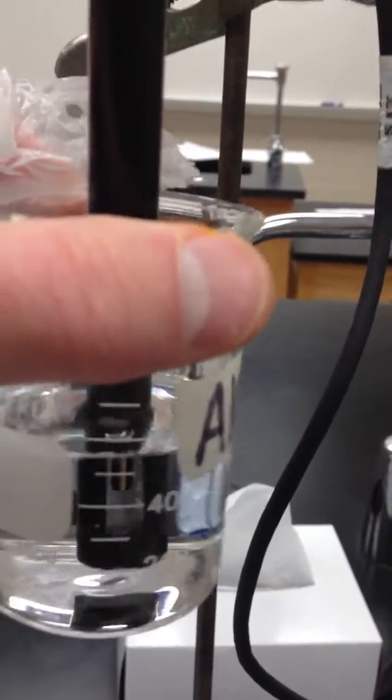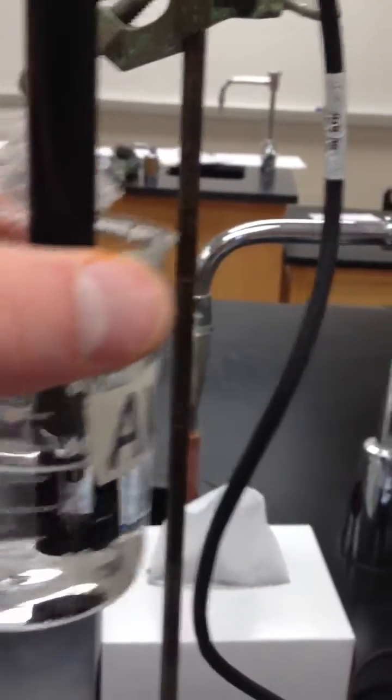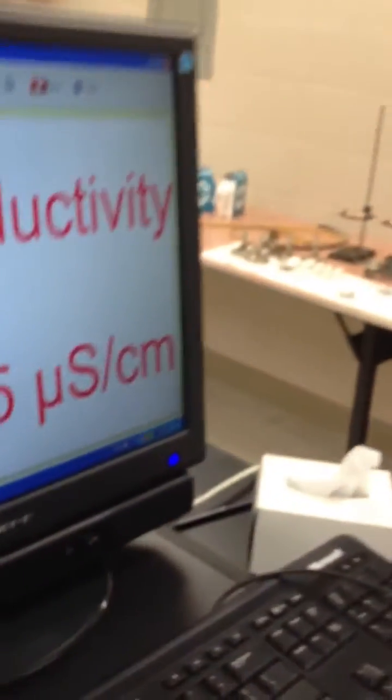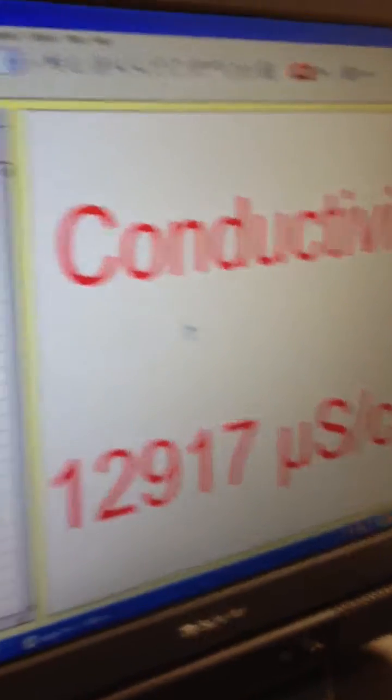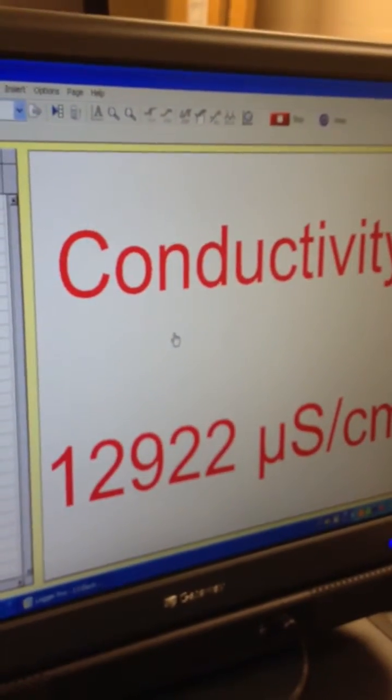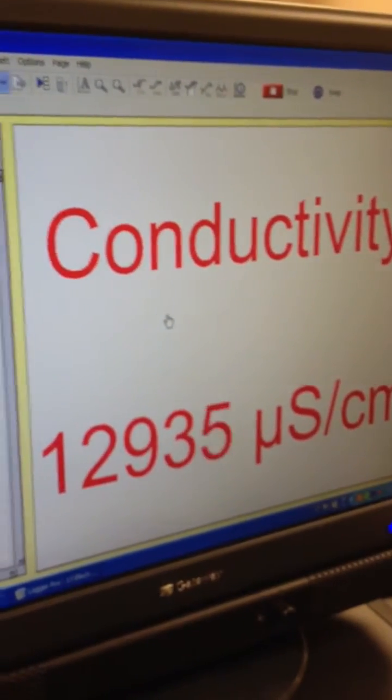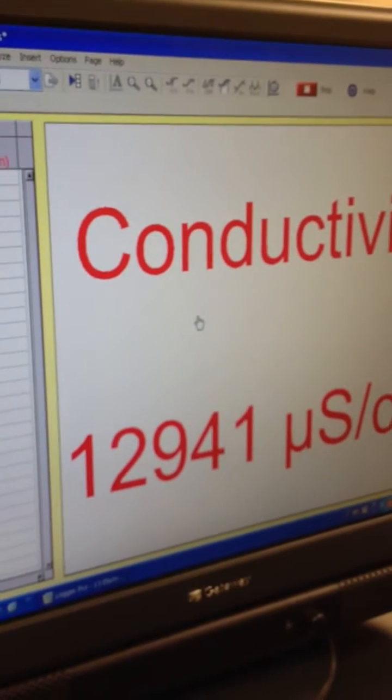One thing you'll notice is that when you get that completely covered, you may have to swirl it. And what you'll see is that we're dealing with a very sensitive scale here. We're dealing with micro Siemens, right? A millionth of the unit.